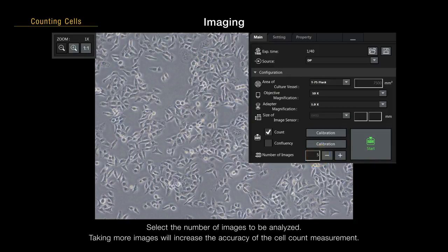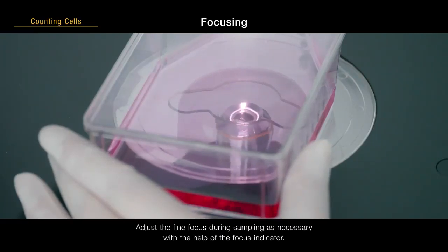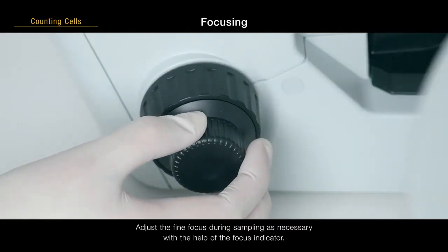Select the number of images to be analyzed. Taking more images will increase the accuracy of the cell count measurement. Adjust the fine focus during sampling as necessary, with the help of the focus indicator.